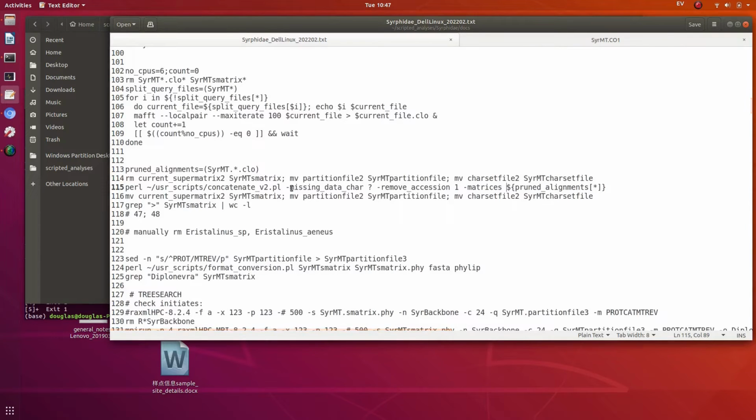It's important to consider missing data, because there are different points at which you may use missing data, and these need to be a consistent character. So I set the missing data character for when this is ever used. If one particular gene is missing from one species, it'll get the missing data character in that part of the alignment. There shouldn't be any missing in this particular case, as mitogenomes in principle have all the same number of genes.